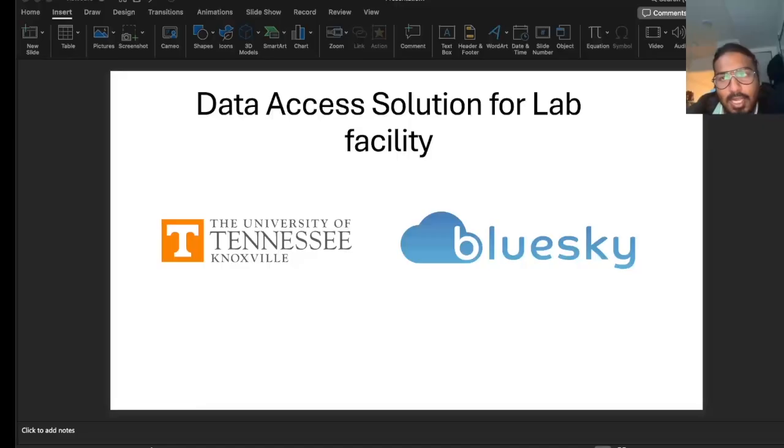If you're working in a lab setting on an instrument, for example an electron microscope, you might have this problem where you finish your experiment and the next user is already lined up, so you don't get time to access your data. Then maybe you request the person, or you come a day later and take the data in your pen drive or put it on the cloud.